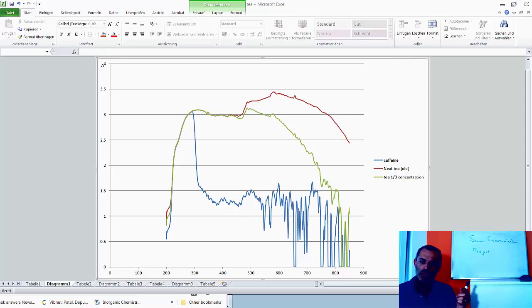If we dilute the tea it absorbs less light up here in the red region. 800 is red. So that's the higher end of visible light and then we get lots of absorption down here and it does something very similar. So if something weird is happening it's probably not working very well the technique. So let's have another look. So I had to do some more measurements.